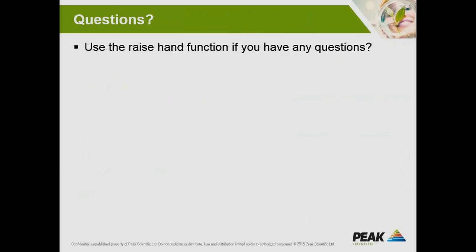And we'd recommend that they're kept within the lab so that the conditions that the generators are stored in are also within the recommended temperature range. So between 20 and 35 degrees, and also so that the humidity levels are not moving around too much. So we normally recommend that the systems are kept between 50 and 70% relative humidity.